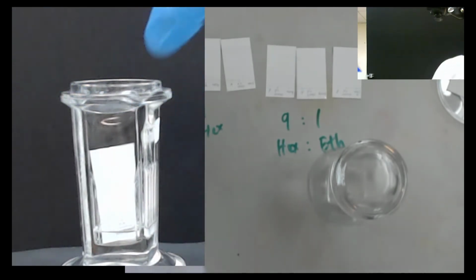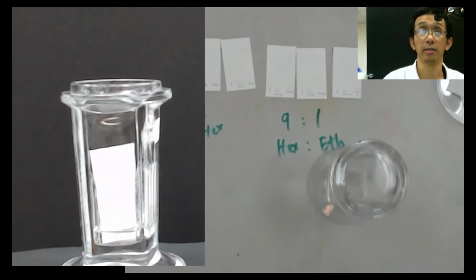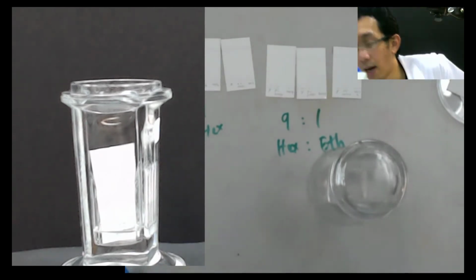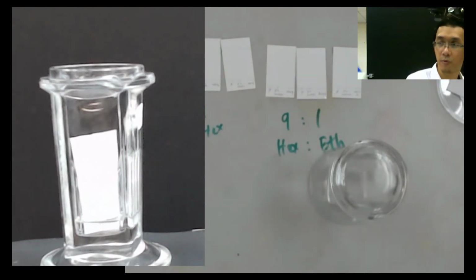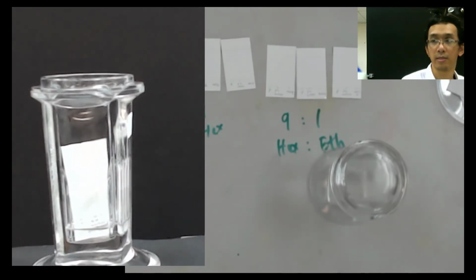Okay. So I hope you can see it's moving up. I don't know from your side how it looks. Can you see the thing moving up? No, sir. No? Because this is the problem with using the webcam here.